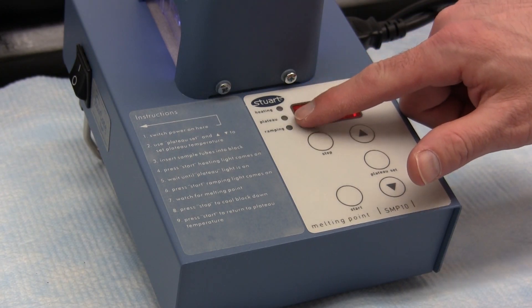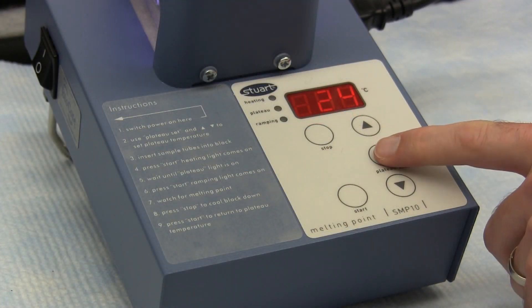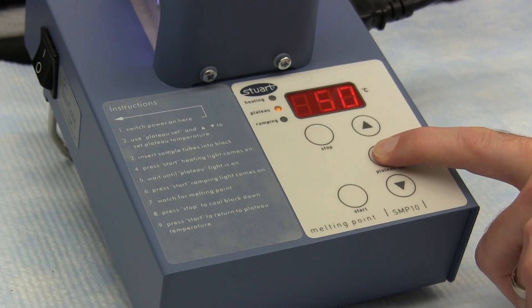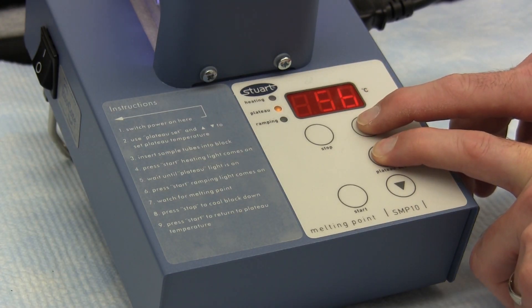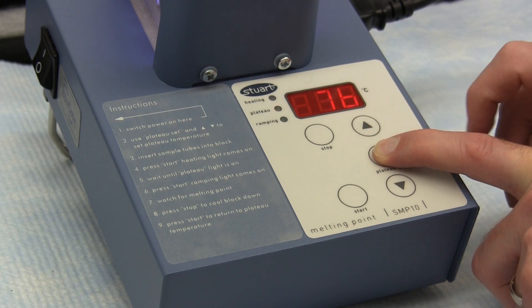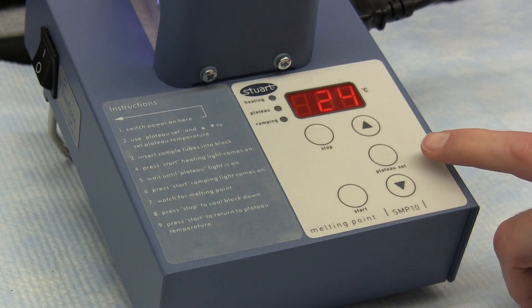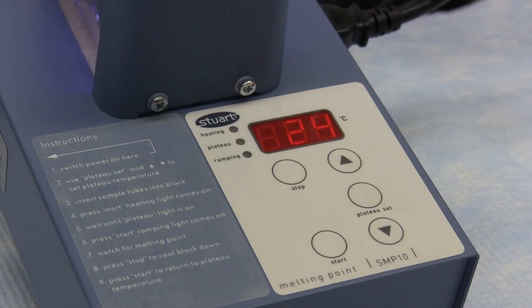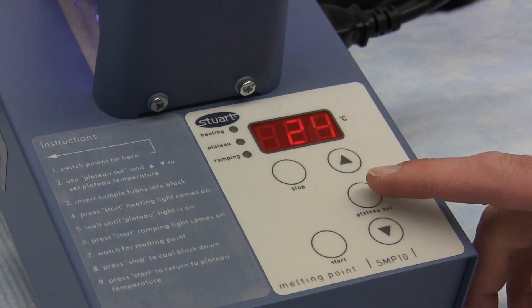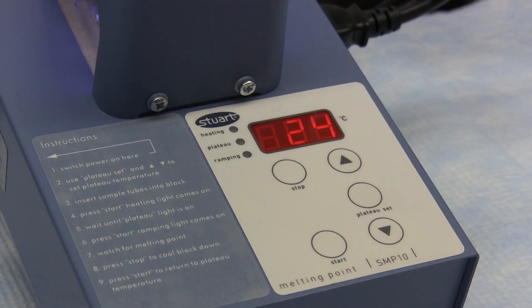Check that all three function lights are extinguished. If not, press the stop button. Press and hold the plateau set button — the light will flash and the display will now show the current plateau temperature. The desired plateau temperature can now be set using the arrow keys to scroll the display up or down as required. Release the set button and the new plateau temperature is set, and all the function lights will go out. The plateau temperature can be checked at any time during operation by pressing and holding the plateau set button; this will not interfere with the melting point determination.